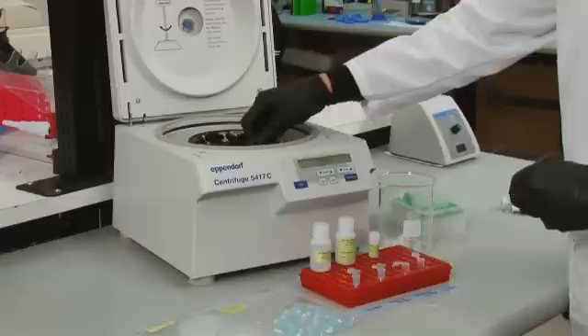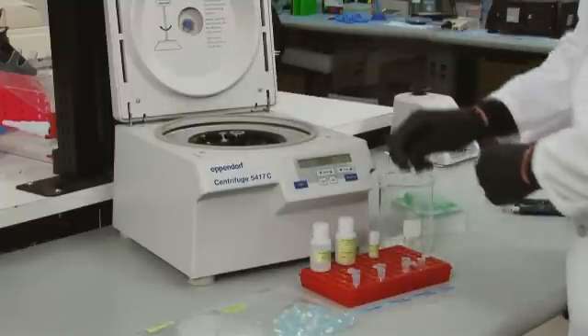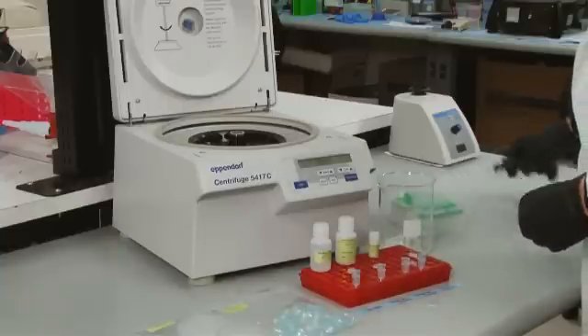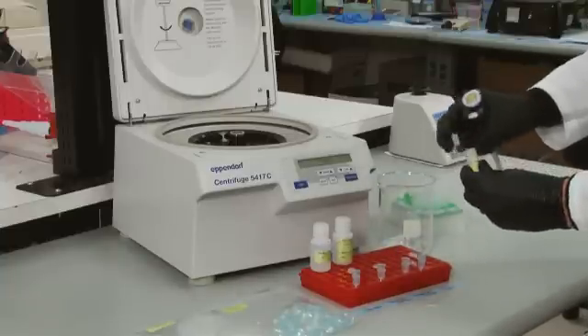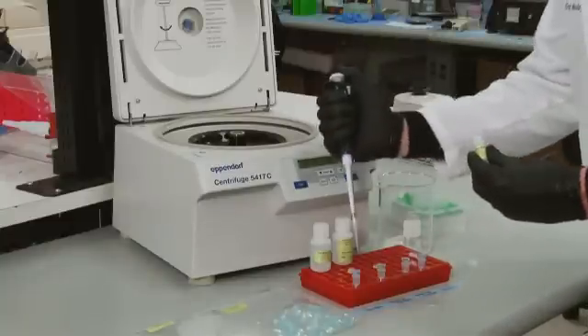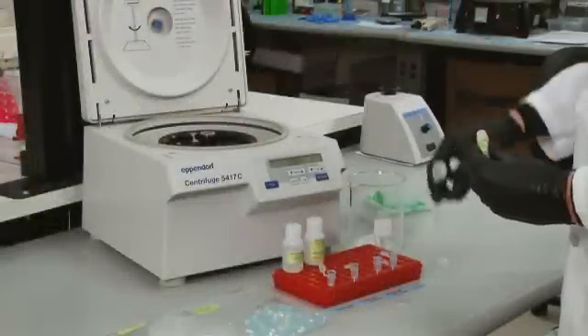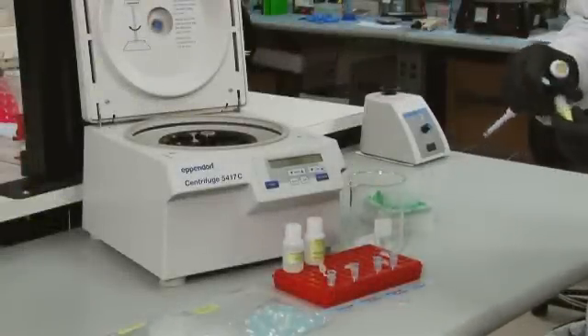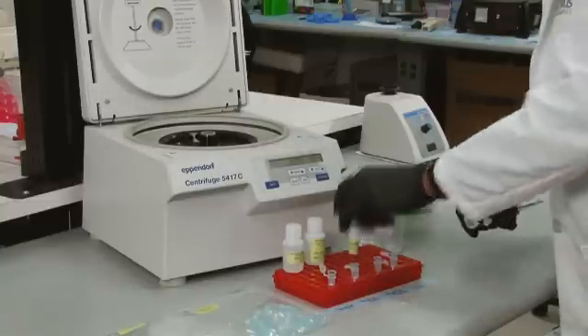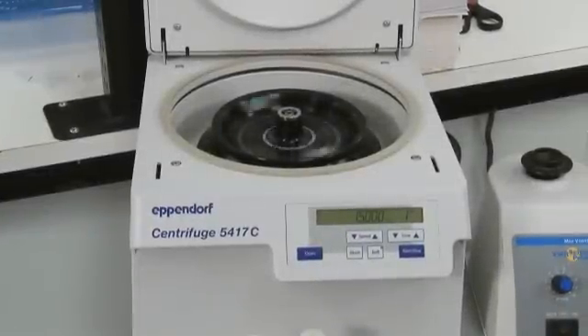Discard the old collection tube and place the purification column into a new, clean tube. Add 50 microliters of DNA elution buffer directly to the membrane in the column. Allow to sit for one minute.